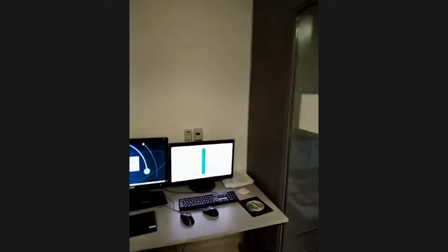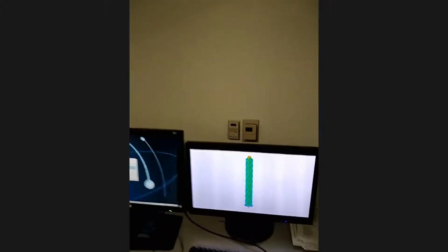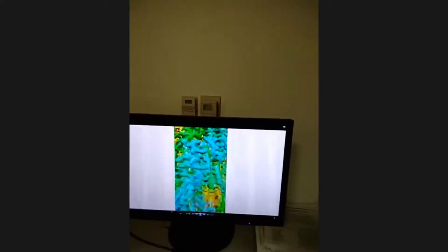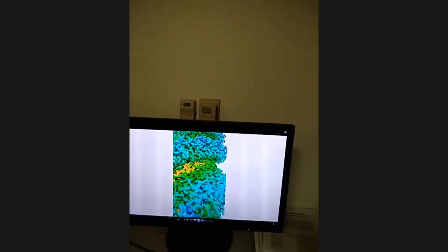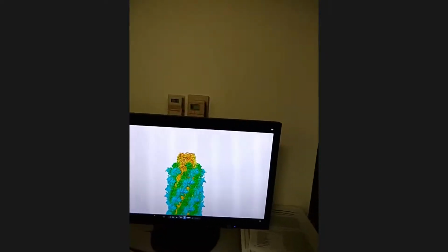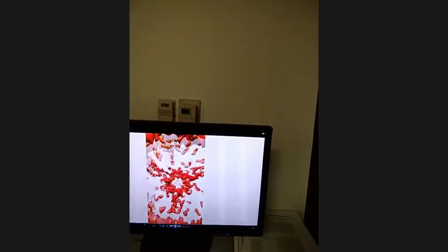And as you can also see, the end product of this electron microscopy will be things like a 3D model of a microscopic object. In this case, it is a bacterial puncturing machine that tries to find the competing bacteria and kill that bacteria, which can also be utilized to make a very narrow spectrum of antibacterial thing.